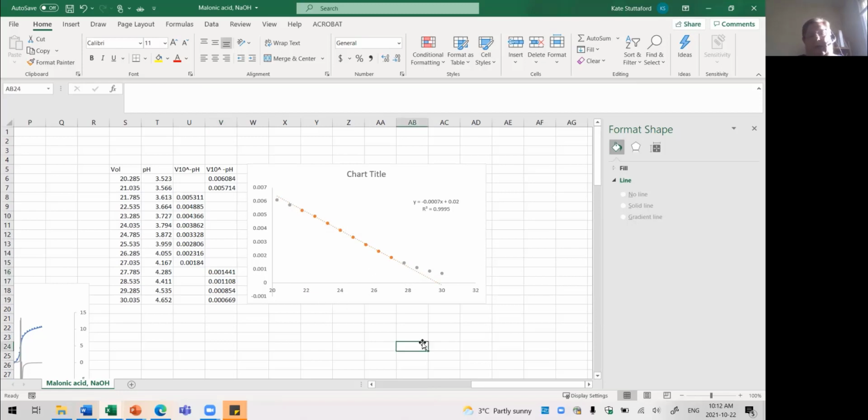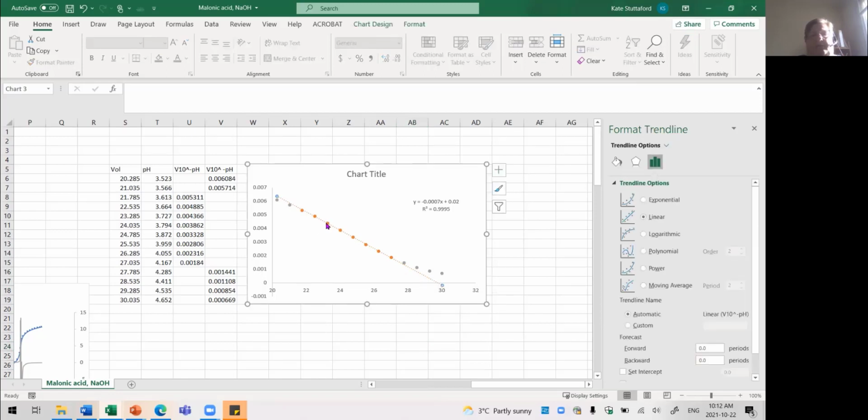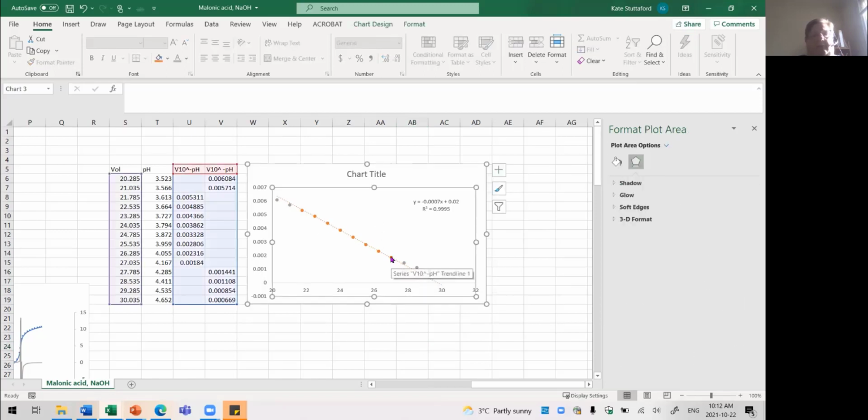So now this Gran Plot, we suggested going back 10 to 20% of the volume, so that we'll be back about up to 6 milliliters. We're going to 8, which is a little bit more, but I still think that's fairly reasonable. Oh, the other thing that I should point out is because this plot, oh, come on, don't be like that. There we go. Because it is including all of these blank spots, the line is actually extended beyond the data, okay? So if I look at, it's not going to let me click on an orange point.